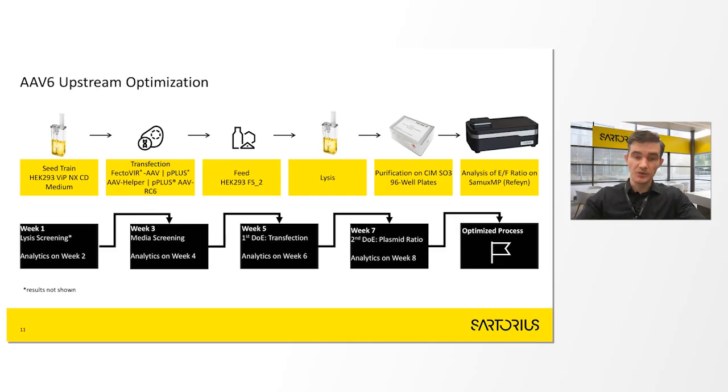Every other week we did analytics where we measured virus titer with dPCR and percent full with mass photometry, and these were our two criteria to continue into the next step.